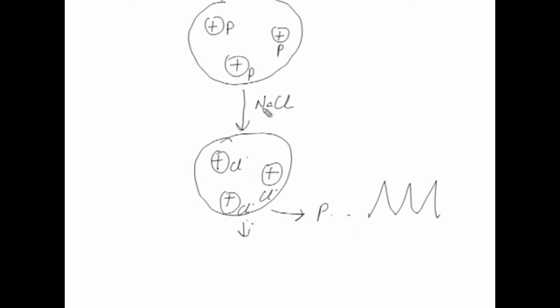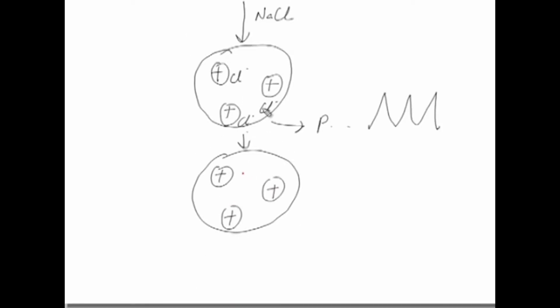Once it is done, then simply what you have to do? Regenerate. Again the simple buffer will be put in, and extra Cl or extra eluent will be washed off, and you will regenerate the column to the starting position, and so this resin could then be reused for another purification. So, in a very simple way I tried to explain the mechanism of ion exchange chromatography.